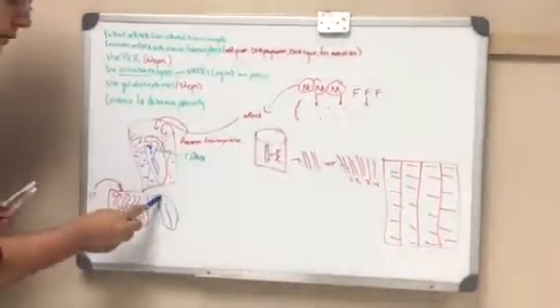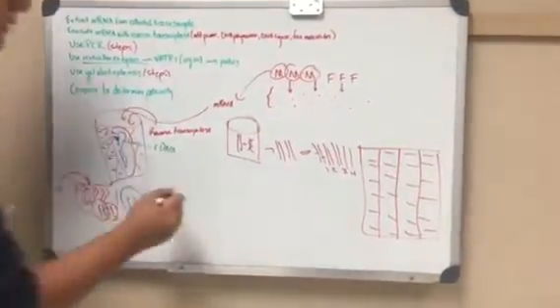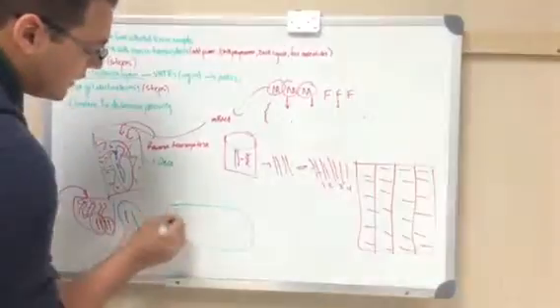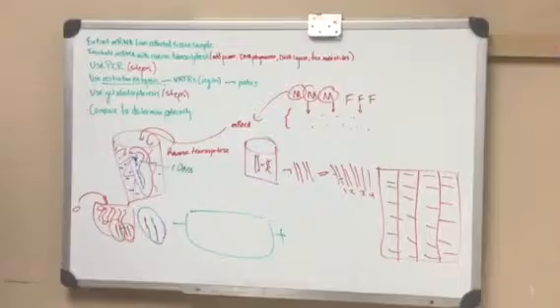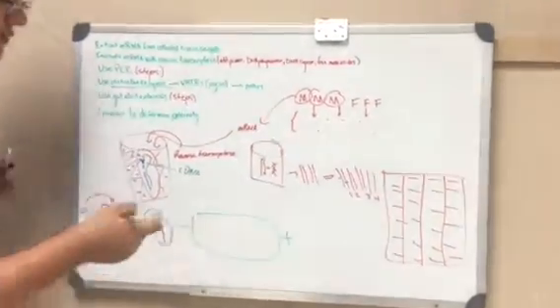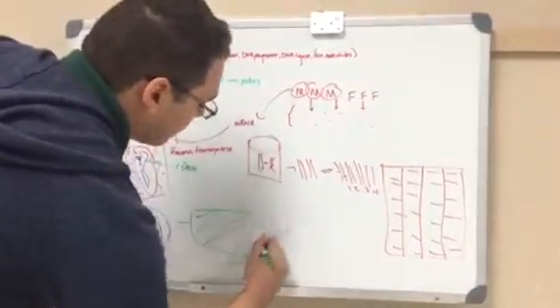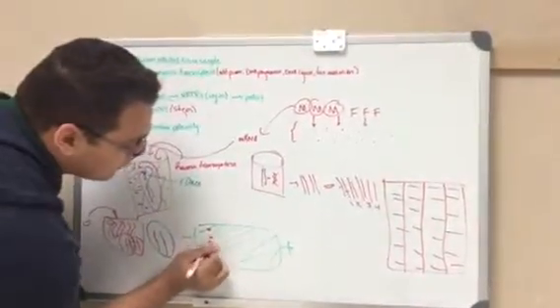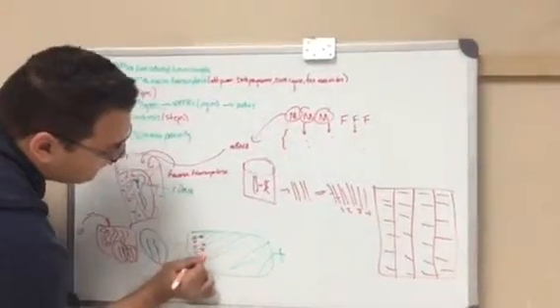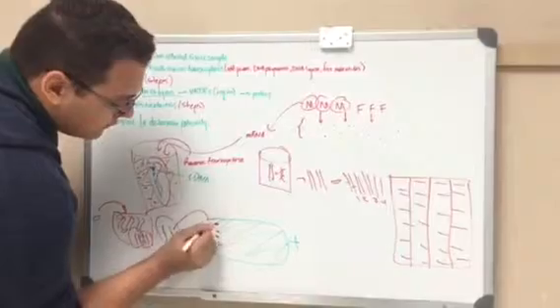So once we have a few of these, there's going to be many of them, we're going to use gel electrophoresis, where we're going to have basically a stage, and we're going to have a negative and a positive side, so cathode and anode. And so we're going to put these down. First we have to make a gel, so we're going to use agarose gel because this is DNA, so it's just a bunch of gel here. And then we're going to make small little wells within the gel, and then we're going to put this in these small little wells.